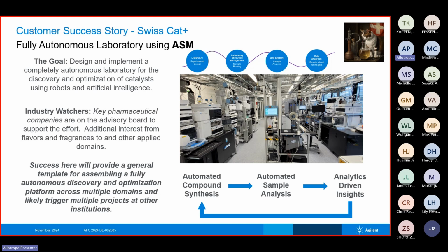Post-conversion, there are two pathways they take. One is to decide what is the next experiment or test that you're going to run, and two is how can tools like a machine learning model identify new compounds or do reference matching with your existing compounds. And I think ASM has been really great for them as a vendor-neutral data format, and they're able to achieve a lot faster within a short amount of time because of the open democratization of the data.